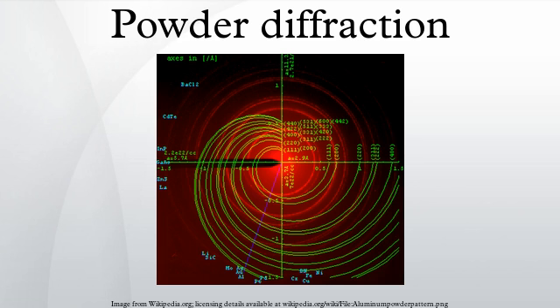Expansion tensors, bulk modulus, et cetera. Cell parameters are somewhat temperature and pressure dependent. Powder diffraction can be combined with in situ temperature and pressure control. As these thermodynamic variables are changed, the observed diffraction peaks will migrate continuously to indicate higher or lower lattice spacings as the unit cell distorts. This allows for measurement of such quantities as the thermal expansion tensor and the isothermal bulk modulus, as well as determination of the full equation of state of the material.